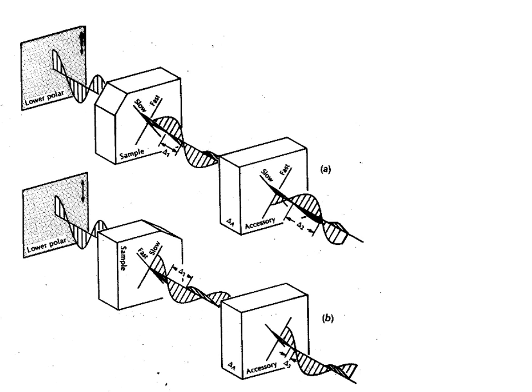So now note that the slow ray, which is the one that's vibrating in the upper left quadrant, it's labeled on there, and the fast ray in the upper right quadrant have been split, and that causes some lag. So the slow ray is going to have a retardation behind the fast ray. And when the plate is inserted with its known orientation, in this case, it has its slow ray also rotated to be in the upper left quadrant.